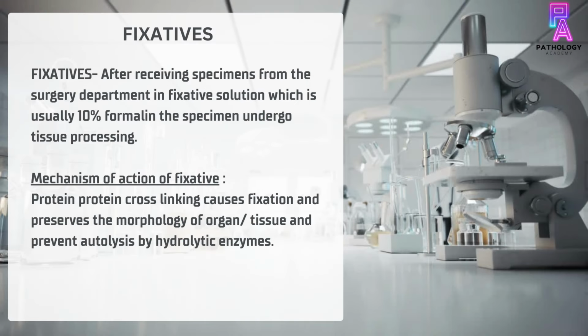Well, after receiving specimens from the surgery department in a fixative solution, which is usually 10% formalin, the specimen undergoes tissue processing. The mechanism of action of a fixative is by protein-protein cross-linking, which causes fixation and preservation of the morphology of organ or tissue and prevents the autolysis of the tissue by hydrolytic enzymes.